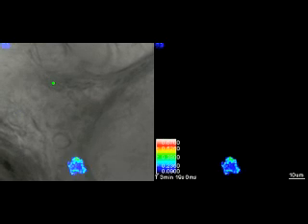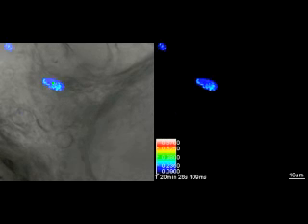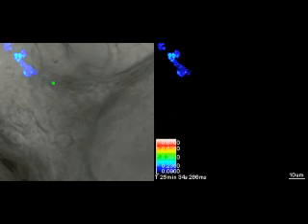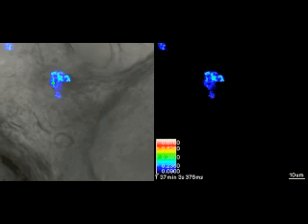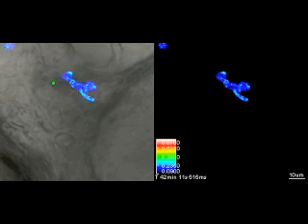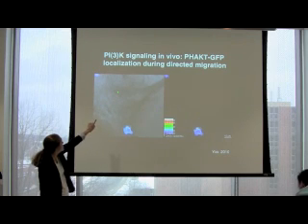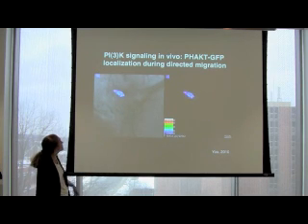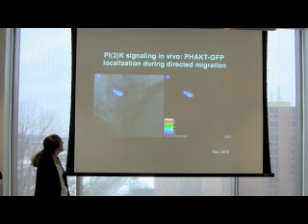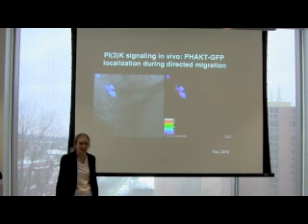We also developed probes to look at PI3 kinase signaling as neutrophils are migrating in vivo. This is a laser wound, and in the very bright areas by ratio-metric imaging you can see active PI3 kinase signaling indicated by accumulation of the PHAKT probe. When neutrophils pause at the wound, you get a loss of polarity of PI3 kinase signaling. When neutrophils are migrating toward the wound, there is a very high signal at the leading edge in bifurcating pseudopods, dominating within the pseudopod that gets selected. As neutrophils migrate away from the wound, the PI3 kinase signal is predominantly at the leading edge.